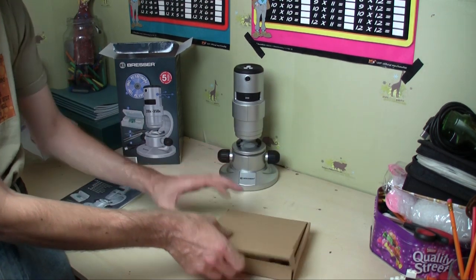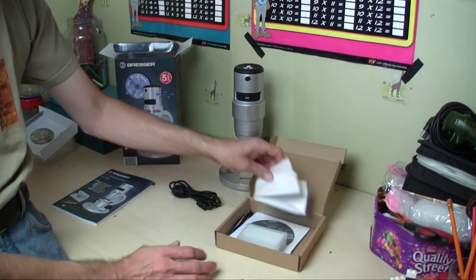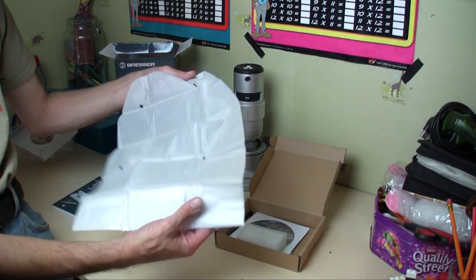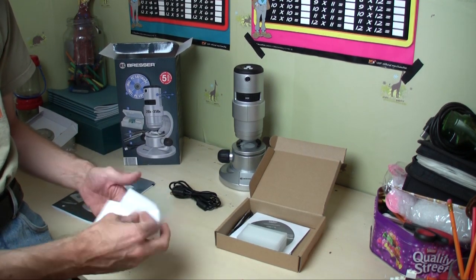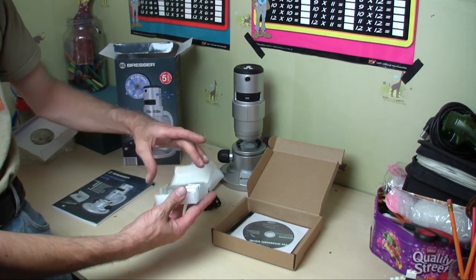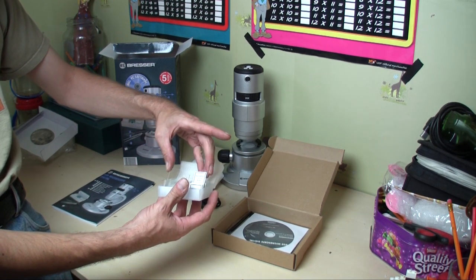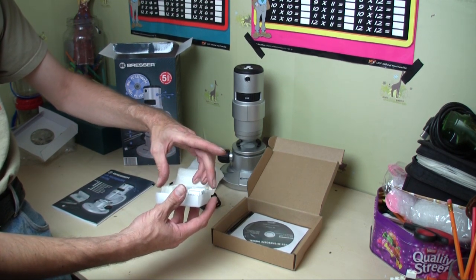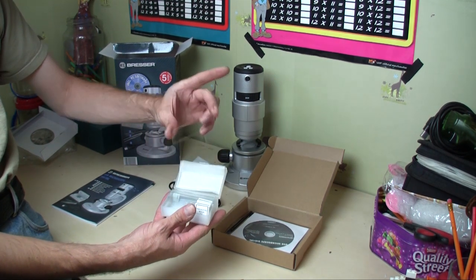In the box we have a USB lead, a dust cover — quite handy really — and a box with some slides in. You've got a couple of slides here; there's a house fly leg which you can have a look at, various other bits, a stem of cotton, and you've got some blank ones as well.